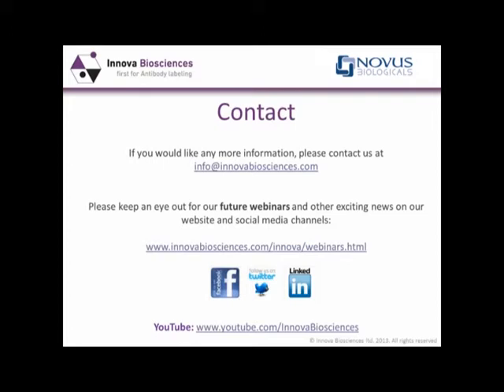The next question is, should you plot micromole of Pi or concentration of Pi on the x-axis of the standard curve? This is a good question. This relates back to enzyme units and some of the confusion that you can have with calculations. It actually doesn't matter which way you do it. If you plot micromole, then it's very simple to move from that to the activity calculation because that is the starting position. You need to know the number of micromoles.